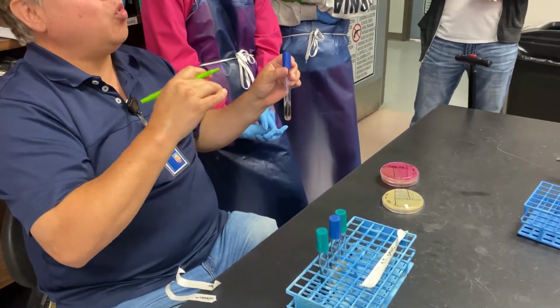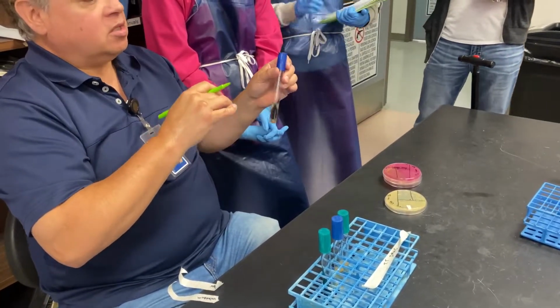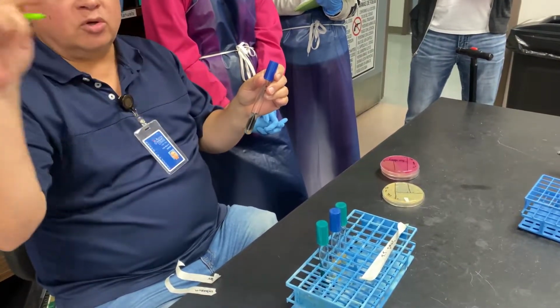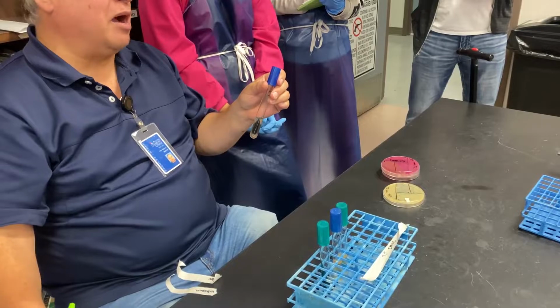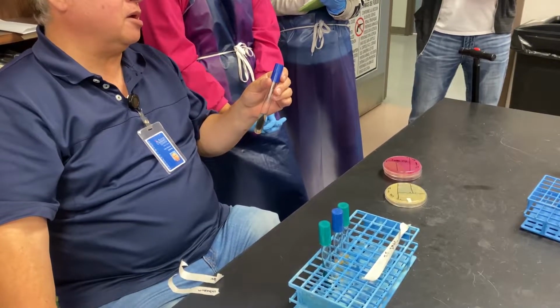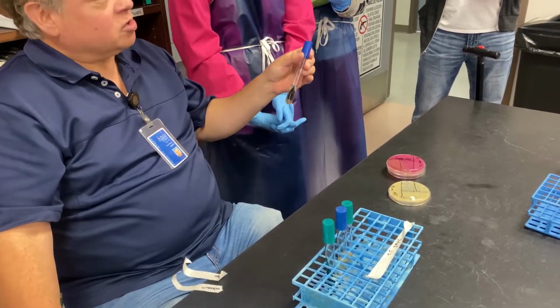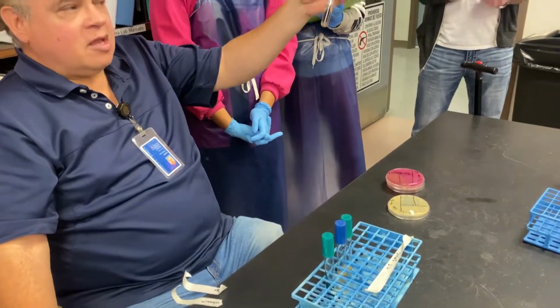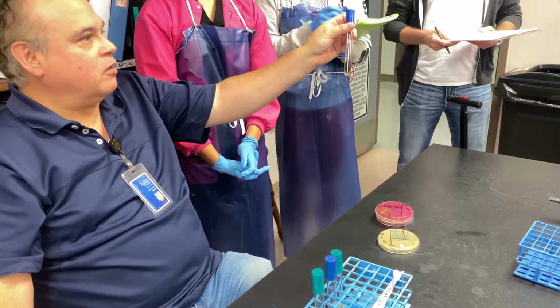So you have to do a regular motility test that doesn't have the H2S in it. Okay? And there's only one down there right now, so Myra's making some more, but it may not be done by the time you need it. So you might have to do this next week, if you have H2S positive. If you don't have H2S positive, you're going to figure it out really quickly.